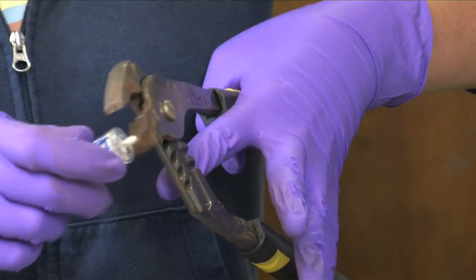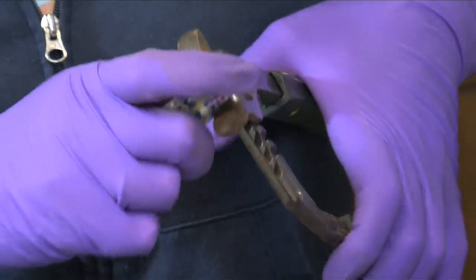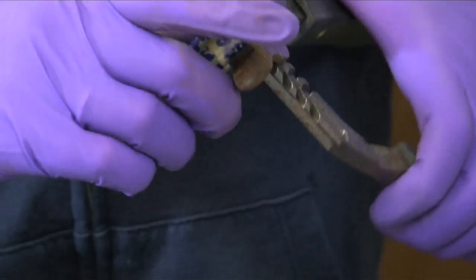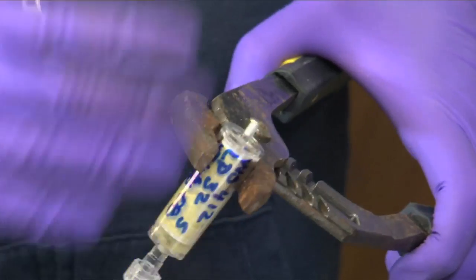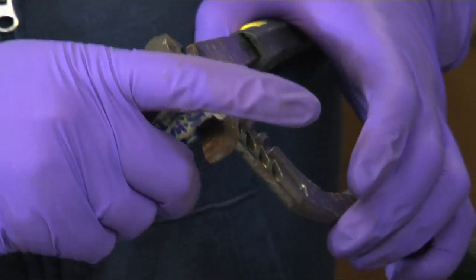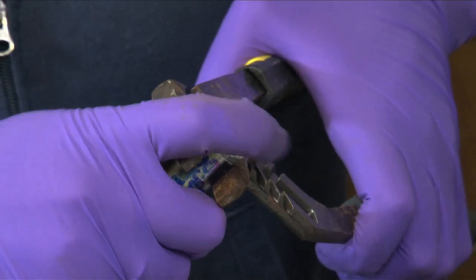And so the first thing you want to do is crack your filter using some pliers. You want to just focus on the very top of the filter — that's where the weak point is. And when you're doing that, you want to make sure the filter doesn't fly off, so you keep your fingers sort of on top of it.